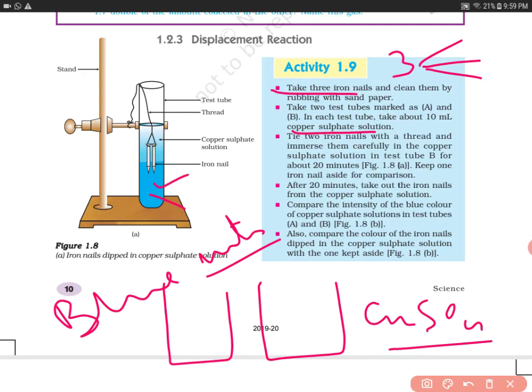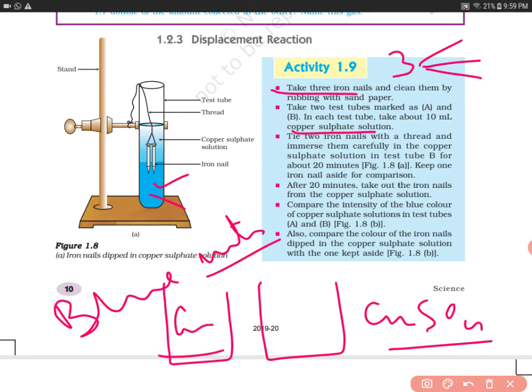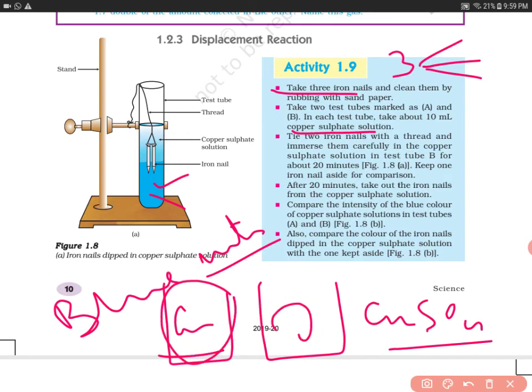Copper sulfate is also called blue vitriol because its color is blue. We will use this to compare it with the other reaction that takes place when we dip the iron nail into it.